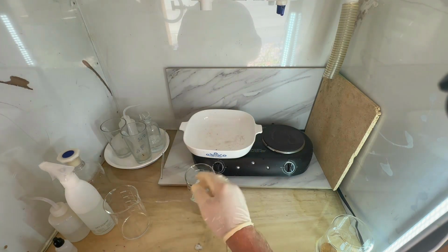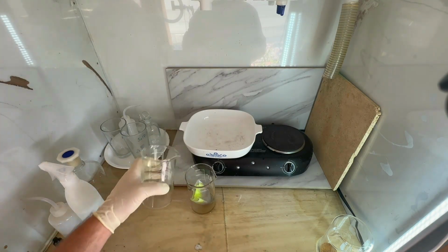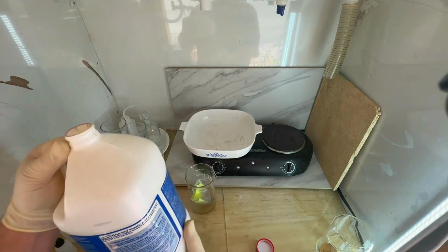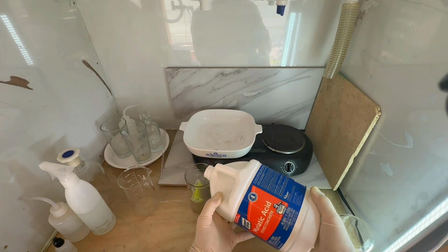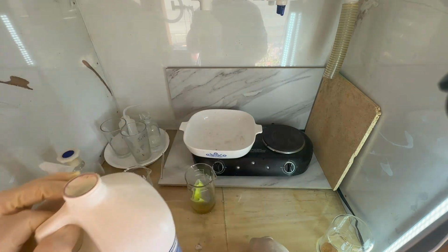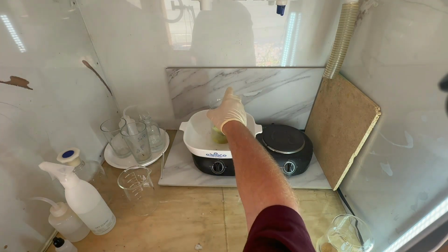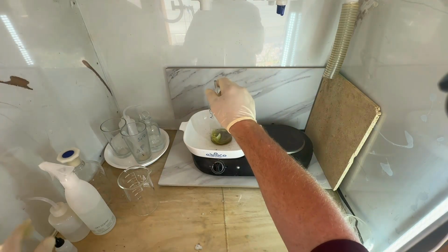So we're going to start here, going to put some hydrochloric, use what's left from what I was doing for the wash. It's going to need a little bit more, so I'm going to add a little more here from a big jug into a tiny beaker. It's probably about 120 milliliters of hydrochloric acid in there. Set it up on the heat, push the filter down in there.